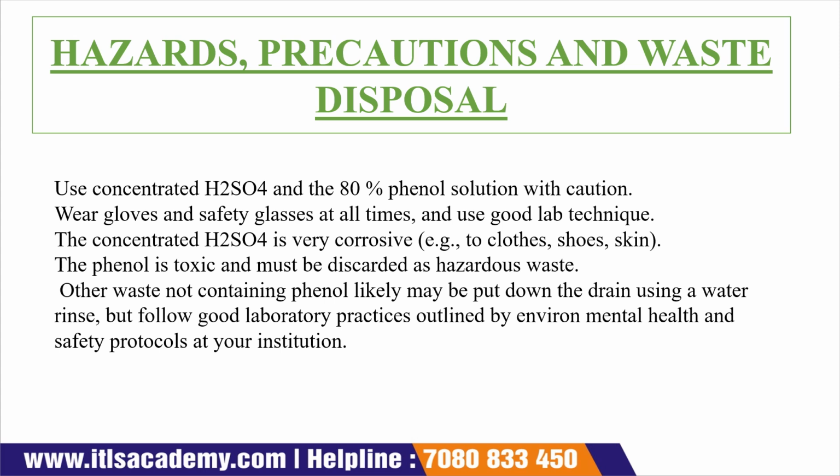Now see what is written in the slide. Use concentrated H2SO4 and the 80% phenol solution with caution. Wear gloves and safety glasses at all times, and use good lab technique. The concentrated H2SO4 is very corrosive, for example to clothes, shoes, and skin. The phenol is toxic and must be discarded as hazardous waste.